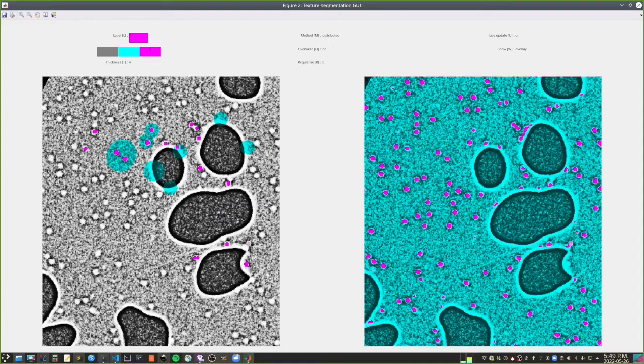It can help you gain more precision than you would even be able to by eye, because you're only on a single fiber at a time, and it would take so much work to compare one against the other and go back and forth all the time.